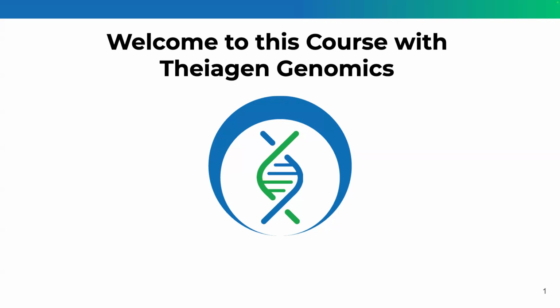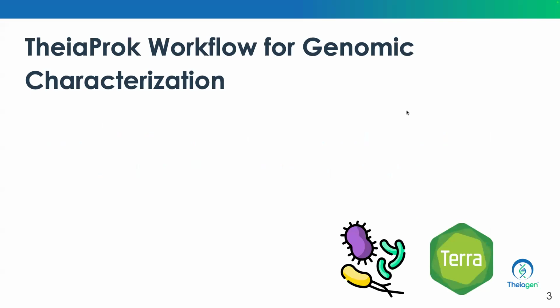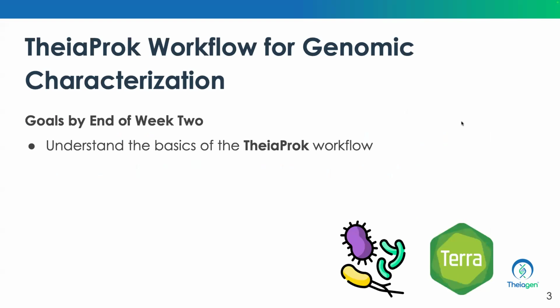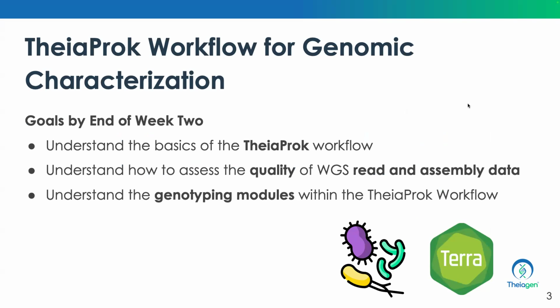So we are going to continue into week 2. And for this week, things are getting hot quite a bit. We are going to be looking at the TheiaProk workflow for genomic characterization. The goals of this week are to understand the basics of the TheiaProk workflow, to be able to assess the quality of the whole genome sequencing read and assembly data, as well as understand the genotyping modules within TheiaProk. Those are the 3 main goals for this week.